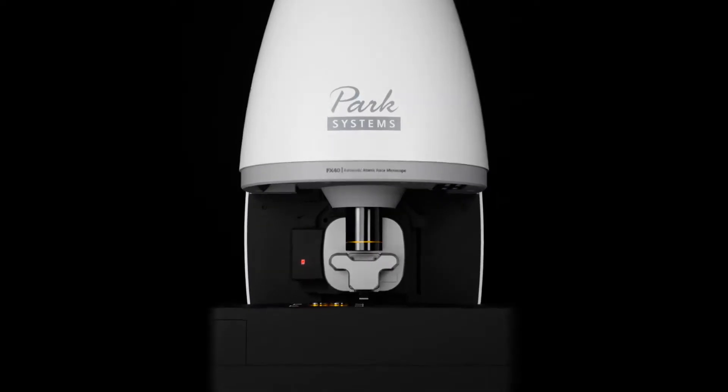Park SmartScan, our software for AFM imaging, has evolved into a more advanced tool for learning automated robotics with new features, using machine learning algorithms and enhanced image processing.